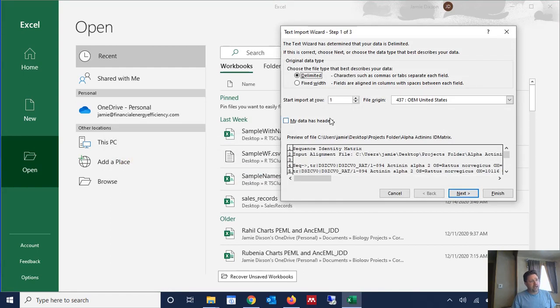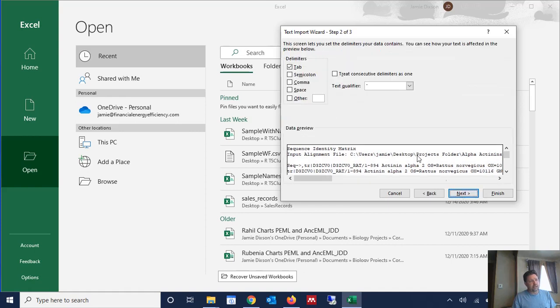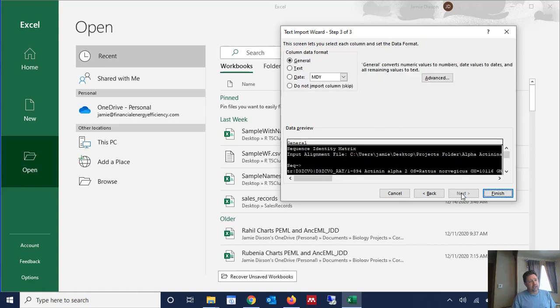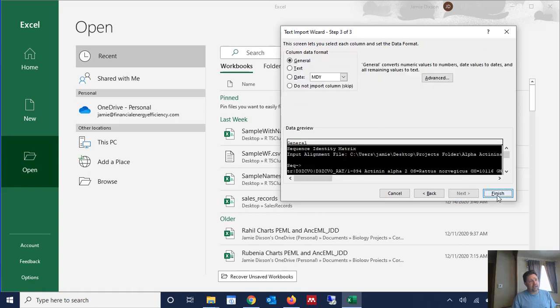And now it's a delimited file, so it's a comma separated value file which is a comma delimited file. And so we're going to leave that on delimited and on the next screen we're going to select comma. We're going to get rid of tab and we're going to click next and then we're going to click finish. We don't need to change the format of any of the columns.